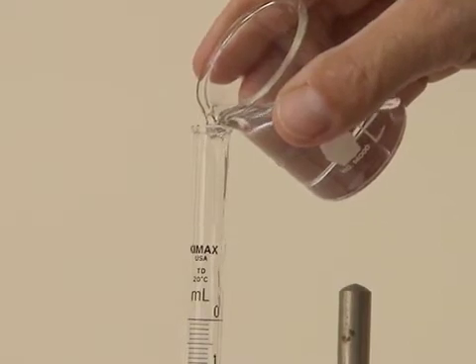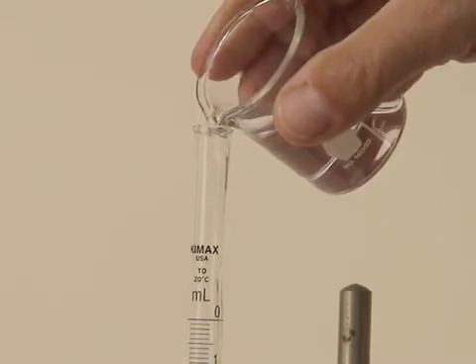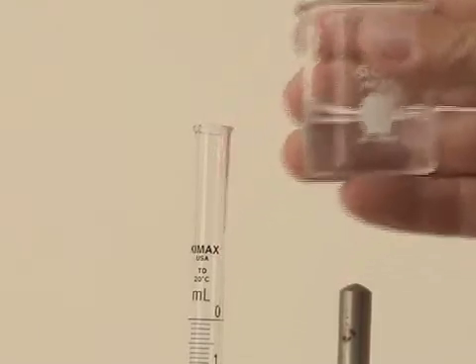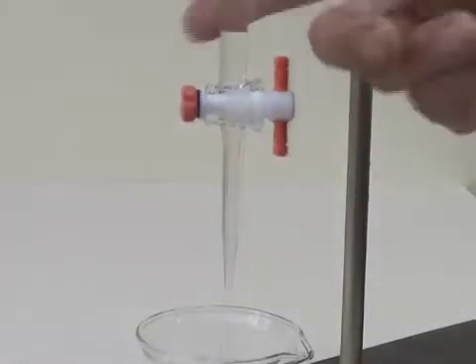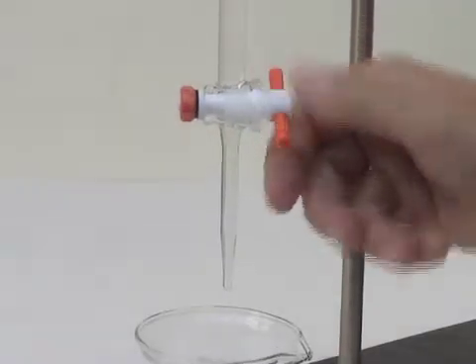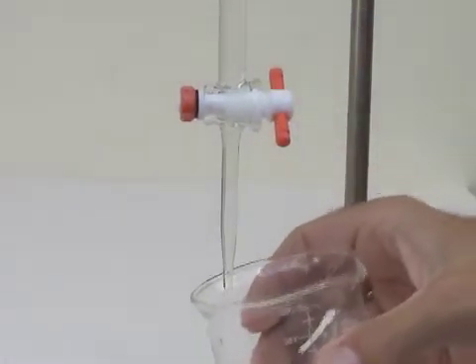The easiest way to do this is just to open the stopcock fully and to give the tip a couple of taps with your finger. You should also touch the tip of the burette with the side of the waste beaker. This will remove any drops that might be hanging there.